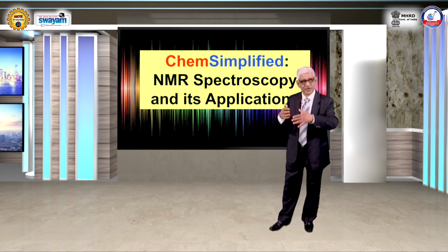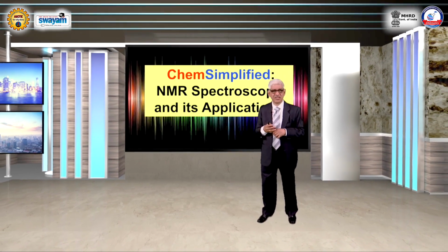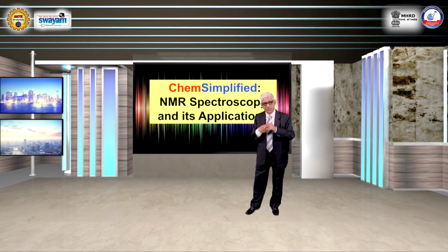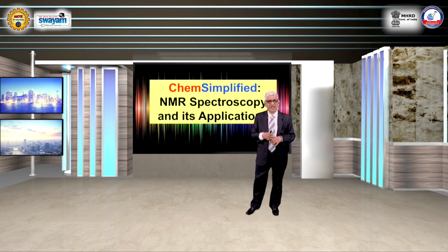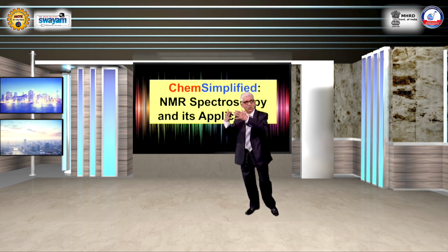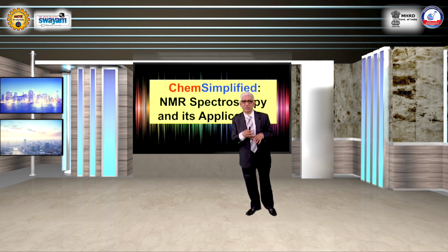Then you had the correlation spectra. There are two kinds of correlation spectra, the so-called COSY and the NOESY experiments, and the COSY experiments actually displayed the J correlations. The protons which are coupled through J coupling will be displayed as cross peaks in your 2D COSY spectrum. And in the NOESY spectrum, you had display of information between protons which are coupled through dipole-dipole interactions. And this dipole-dipole interaction actually depends on the inverse 6th power of the distance. The NOE, the nuclear Overhauser effect, is inversely proportional to the 6th power of the distance between the protons.